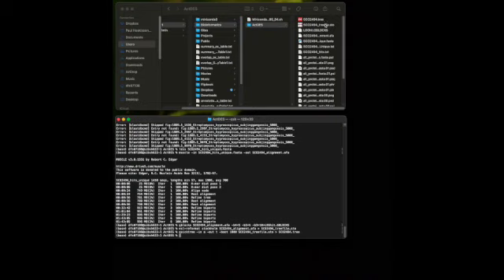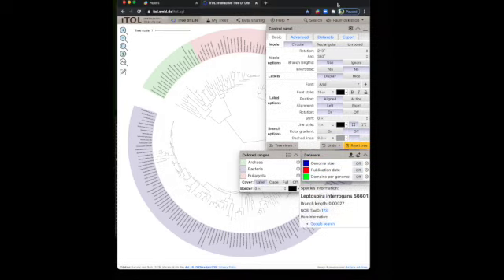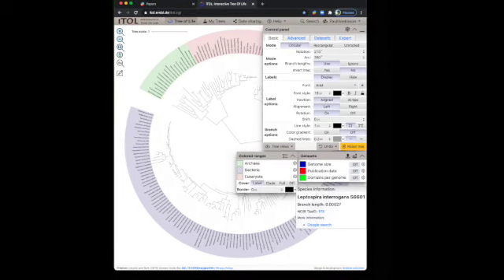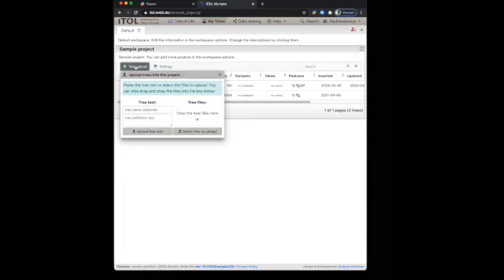So now we need to view this, and there are several tools available to view and visualize trees. The one that's simplest to use is Interactive Tree of Life, or iTOL. So we can create an iTOL file. Go to My Trees and you can click Tree Upload.